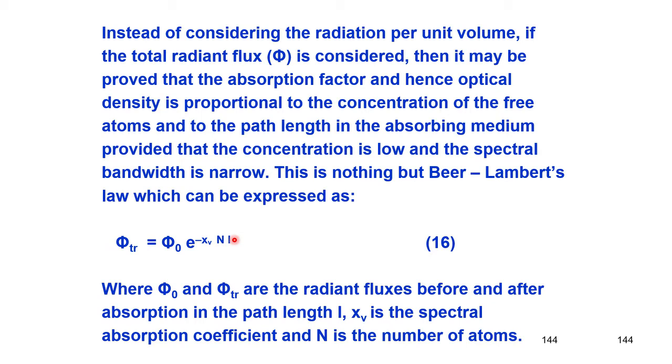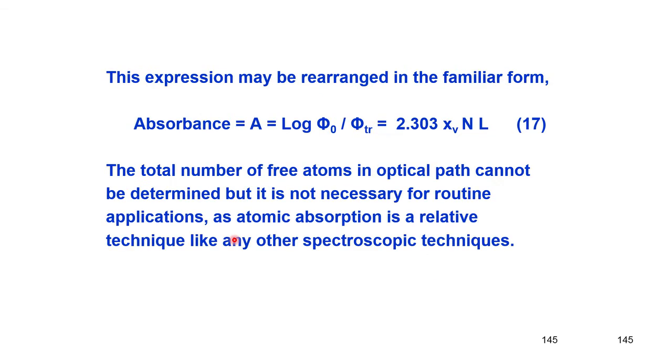So, phi transmitted is equal to phi 0 into e to the power of minus chi v into n, the total number of atoms, multiplied by L. So, take logs now, and that comes to a familiar term for us.